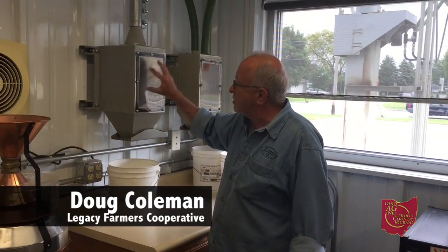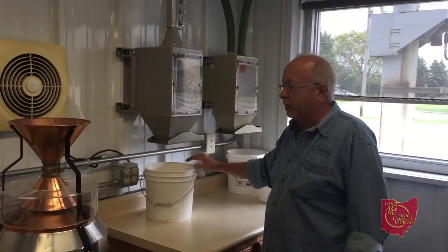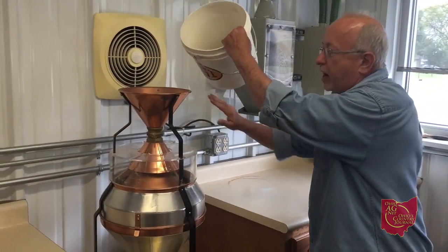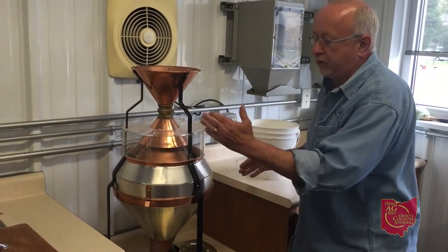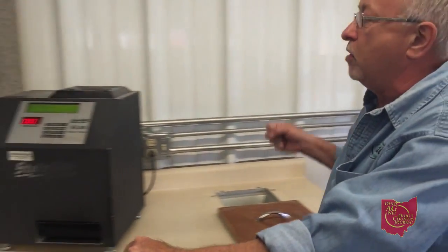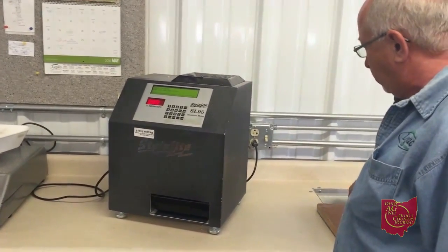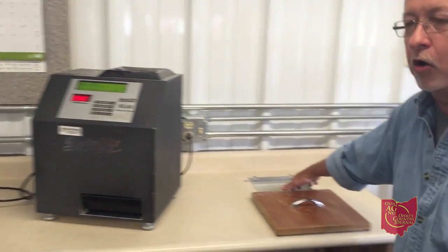Hi, I'm Doug Coleman from Legacy Farmers. Our sample comes in to the Inbound Garner here. We empty it into a bucket, pour it into a divider which breaks it down roughly into a thousand grams per pan. You bring both pans over, and one pan you pour in here and get ready to sample into our blowout here.